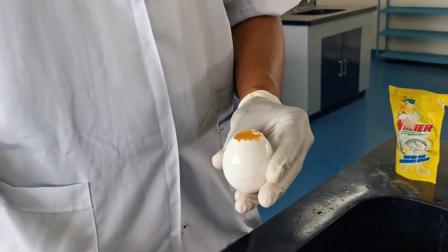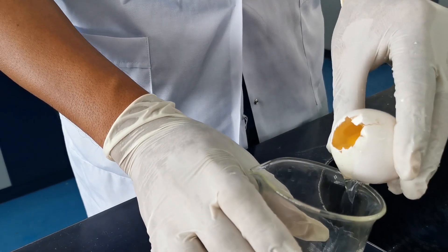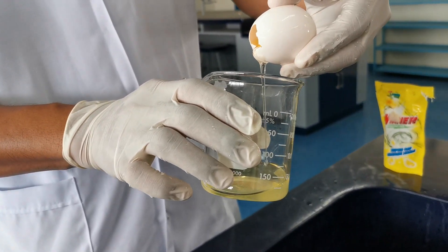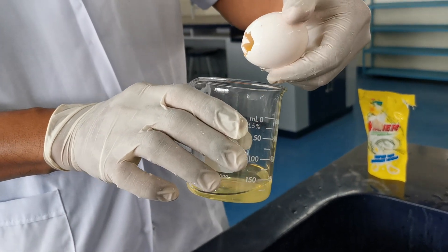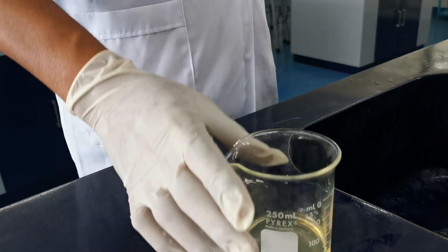Before we proceed with the different tests for proteins, we need to prepare the albumin solution. The albumin solution is prepared by beating egg white in five volumes of water. So we need to separate the egg white from the egg yolk.